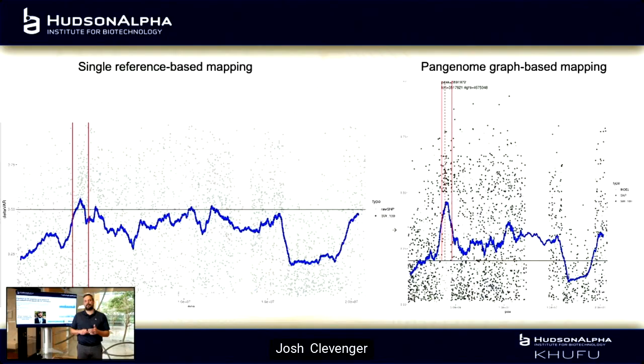And then one more example, and this one's not as interesting and a little more generic, but it's a group we worked with where we were mapping a trait that's really impactful for their program. The way we do mapping, in some cases, is something called QTL sequencing, where we sequence bulks representing the tails of the phenotypic distribution of a population. Then we look at genome-wide allele frequencies, and you can find a peak where the phenotype is being controlled by the underlying genotype.